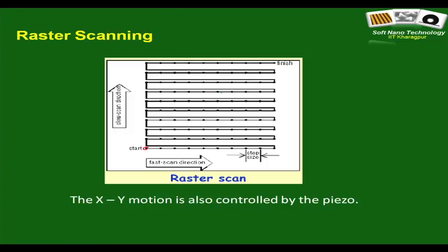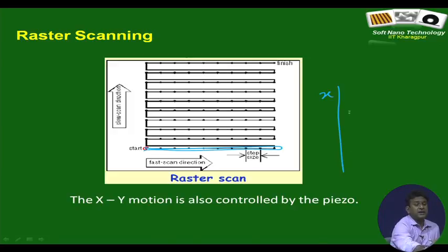So, this picture now should make sense to you. This is the rastering option. So, it is in fact a nested do loop, nothing more than that. It is a nested do loop. So, you just go on gathering the data, and now you understand that after your complete scan is over, you are simply going to generate a data file like this, right.